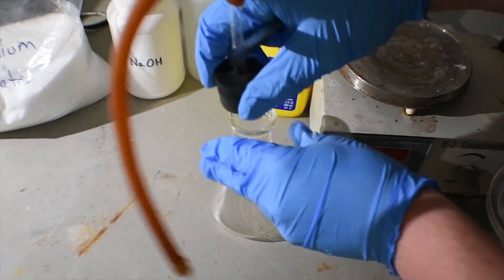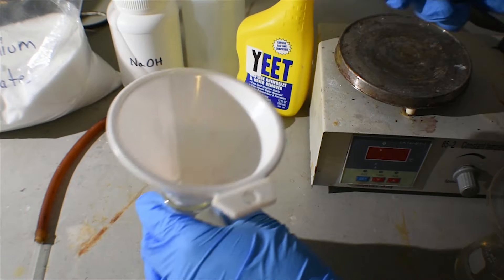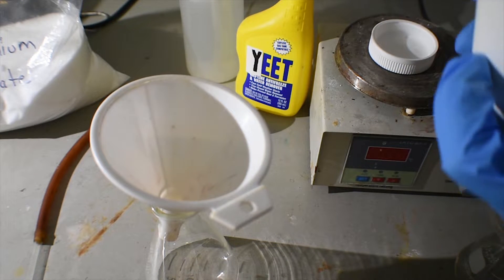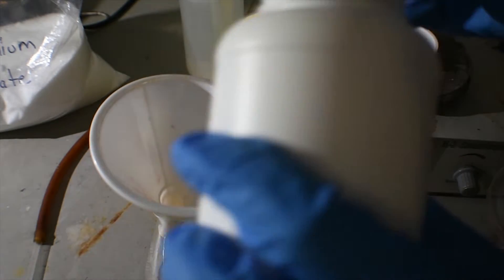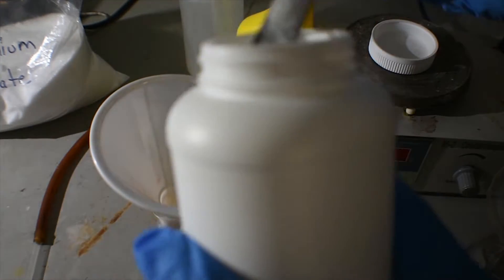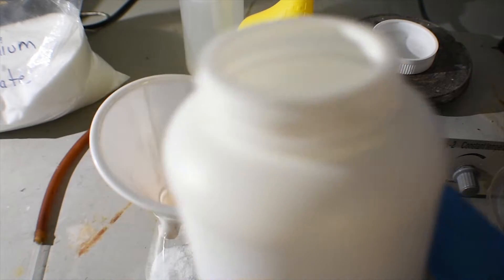Setting up the ammonia generator is very simple. We're just going to add pretty much equal portions of both sodium hydroxide and ammonium sulfate to this Erlenmeyer flask. Let's do four scoops of each.